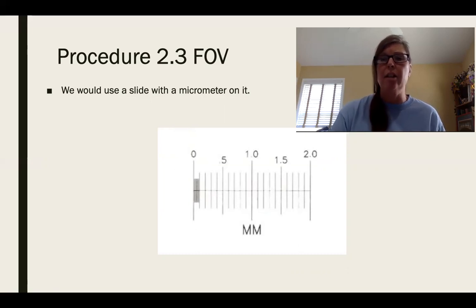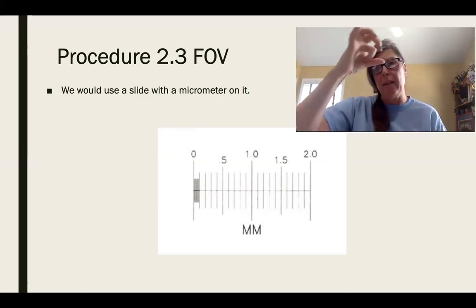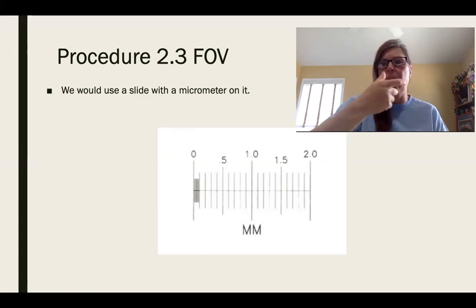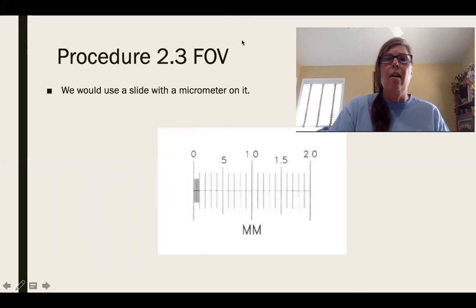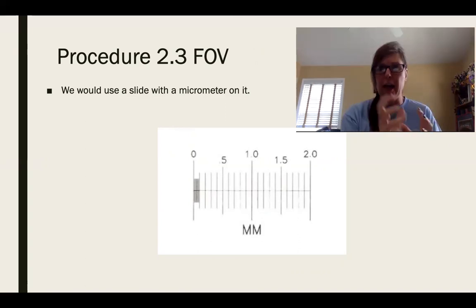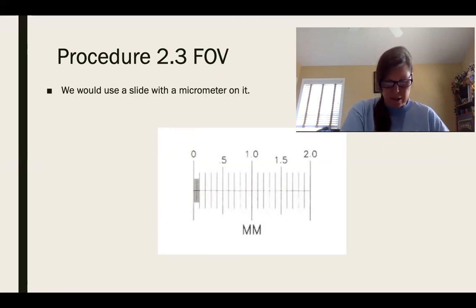You also have what is called a diaphragm, a condenser diaphragm, and it's a little aperture that sits underneath the stage. And so that will control how much light actually goes through the stage. So there are 2 places you can control the light. And that's one of my biggest problems, that I have students that get headaches because they've got the light just blasting at them. And I'm like, turn it down and we'll mess with that. So of course we won't have that experience here, but when you do take your next class, if you have to use a microscope, remember it may be too dim, and so you need to mess with those 2 adjustments, or too bright. So those are 2 places you can adjust the light.